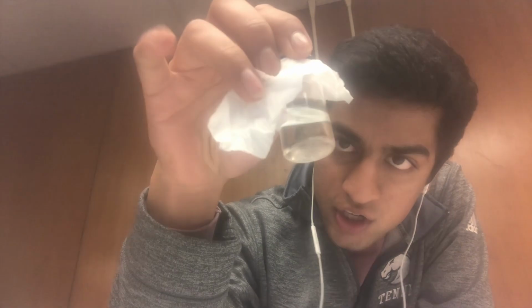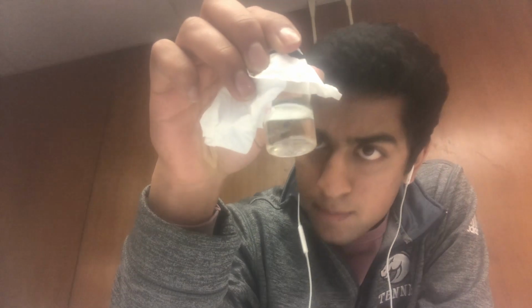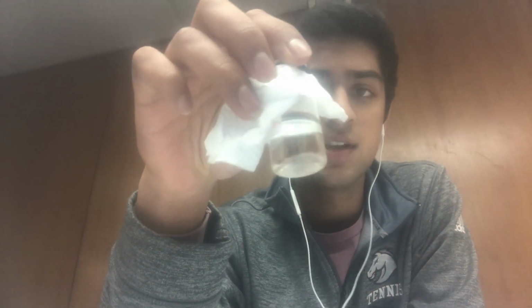So this is the second post-lab video for my alum lab, and so far we've got some decent crystal growth, as you can see right here. There is a noticeable difference this week than there was 2 weeks ago. In the solution, there is a significant increase in the number of crystals. There are cloudy substances inside the liquid, which I think could be the development of more crystals. So that's pretty interesting to see what's happening.